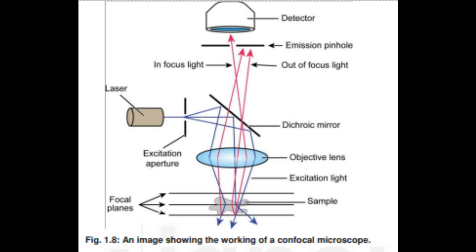Some cellular components fluoresce naturally and appear in various colors, while non-fluorescing structures fluoresce after staining with fluorescent dyes, fluorochromes. Fluorescent dyes are used in the preparation of antibodies that bind to specific cellular proteins. The antibodies are first tagged with fluorescein, a fluorescent dye, and then the fluorescein-labeled antibody is applied to cells.